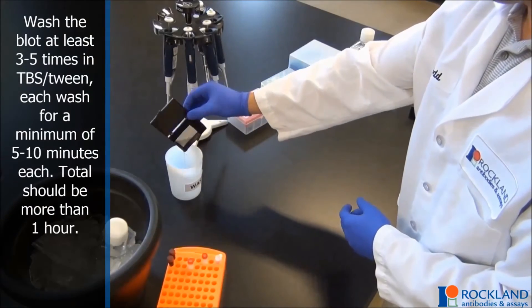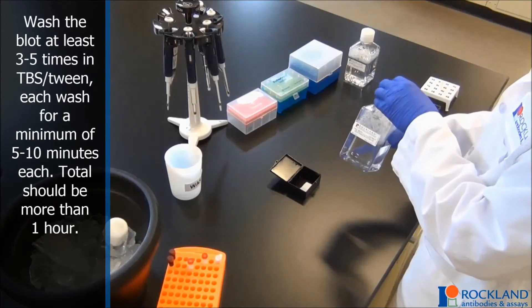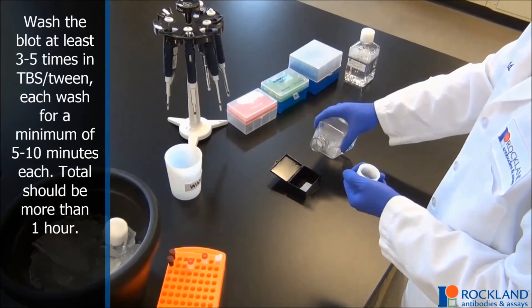Wash the blot at least 3 to 5 times in TBS-Tween. Each wash for a minimum of 5 to 10 minutes each. Total wash time should be more than 1 hour.